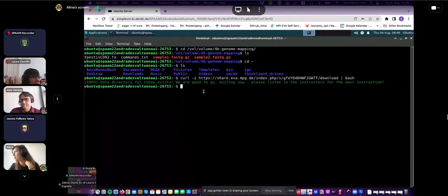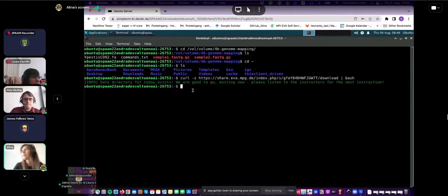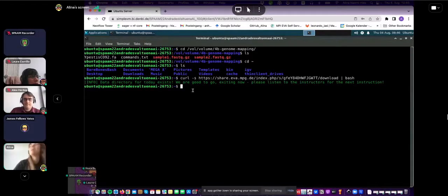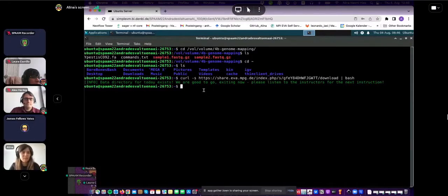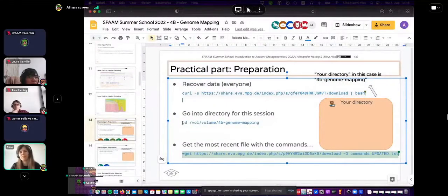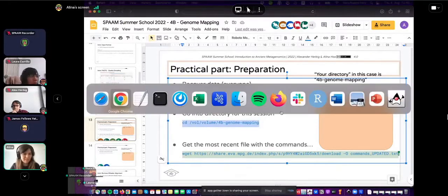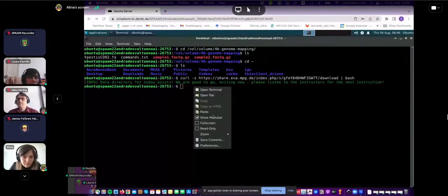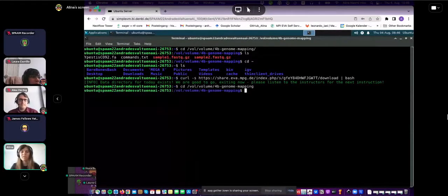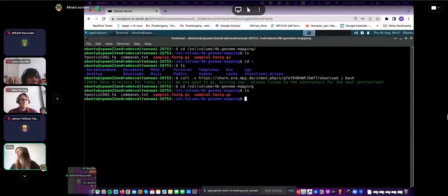Looks good. We are not in our directory yet — we'll go there in the next step. The next thing is to change directory into where we want to go: vol/volume/4B genome mapping. Once you type ls, you should see the expected files.